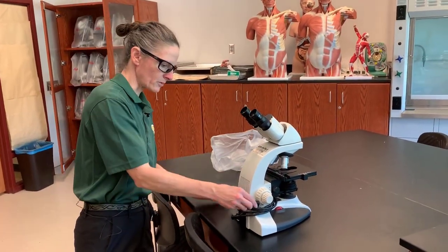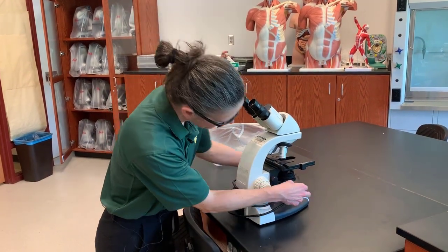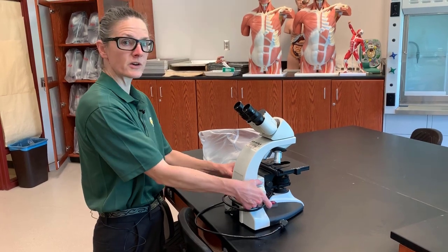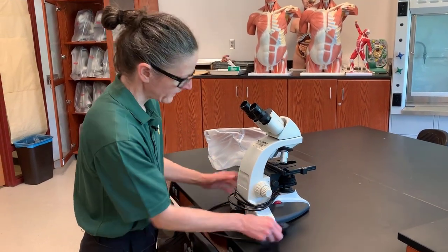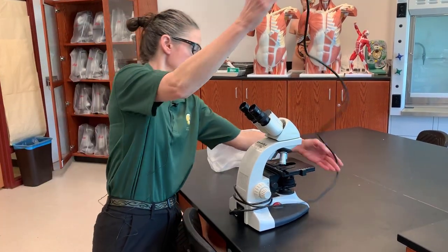You'll notice that the cord is wrapped up around the microscope. We want to unwind the cord. We never want to leave the cord wrapped up around the microscope because there are moving parts here that can crush the cord if you're not careful. So we always unwrap the cord from the microscope.